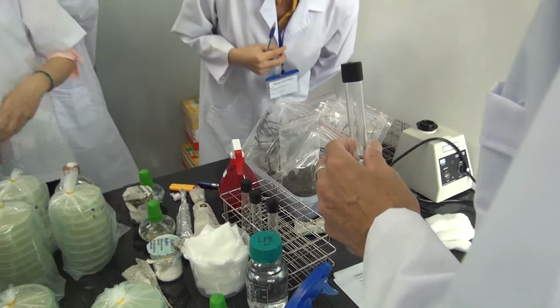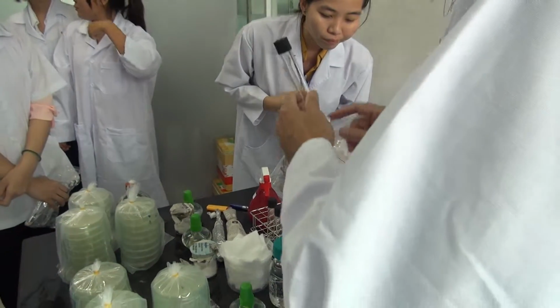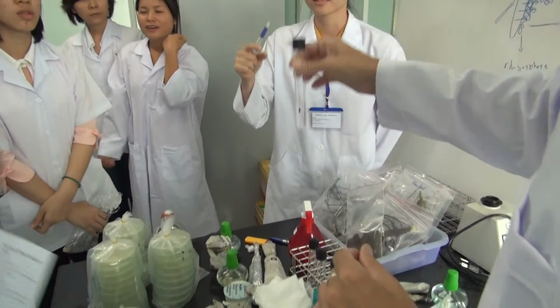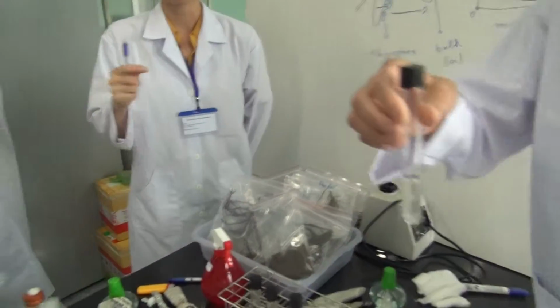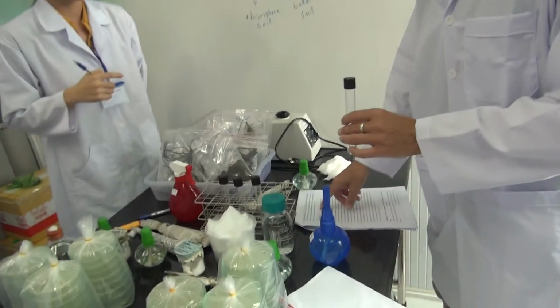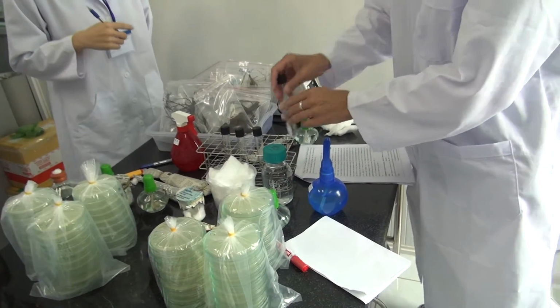How much did we say in the dilution tube? We will vortex it and make the dilutions up to 6. So 1, 2, let's maybe.